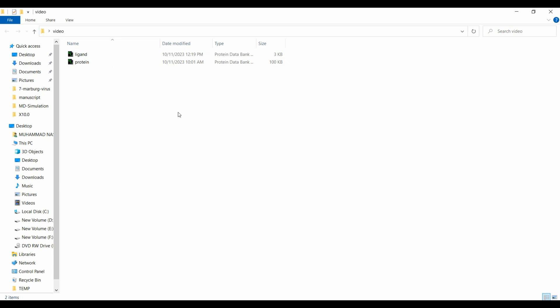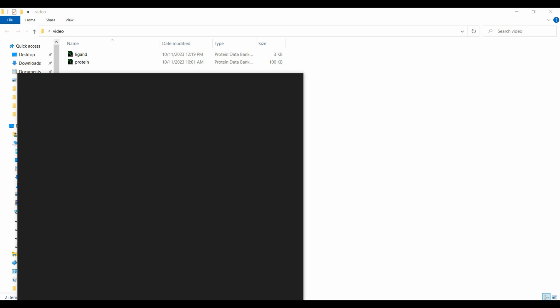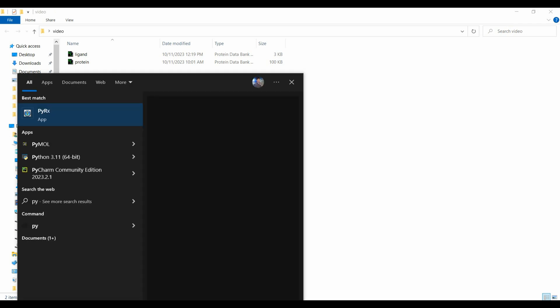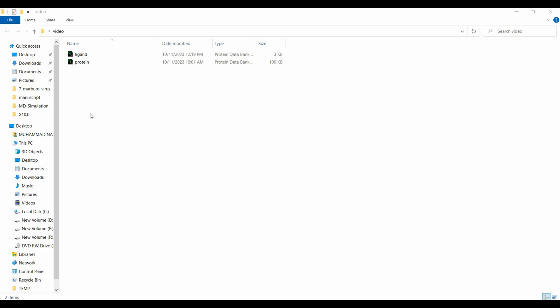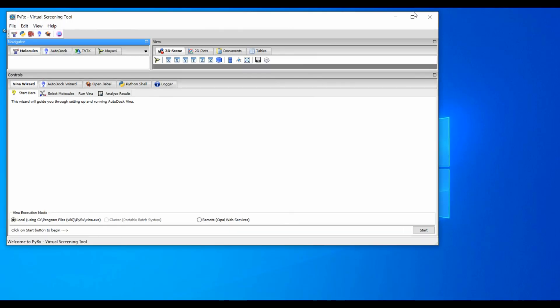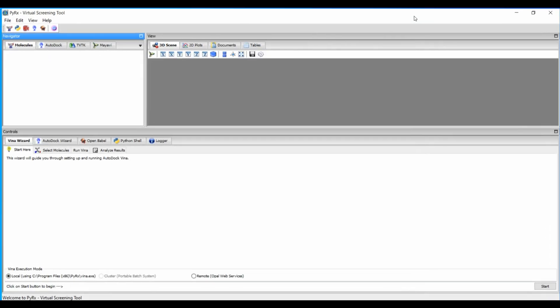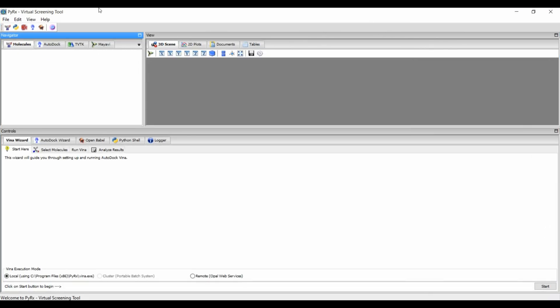For molecular docking I will use PyRx. PyRx provides a graphical user interface and at the back end the algorithm is AutoDock Vina. So we will perform docking using AutoDock Vina via PyRx.